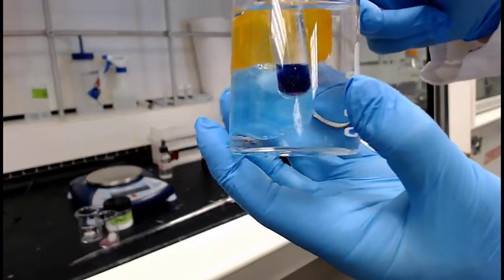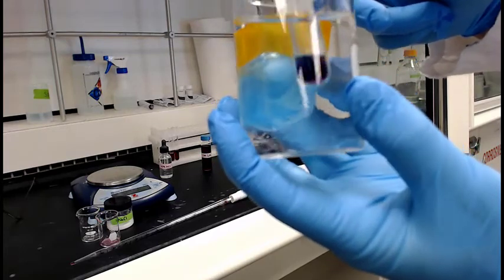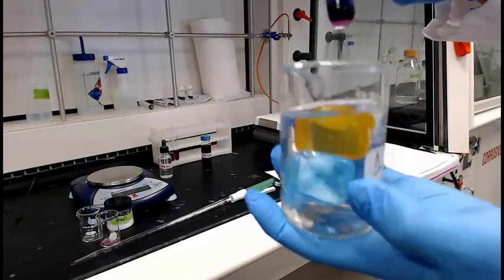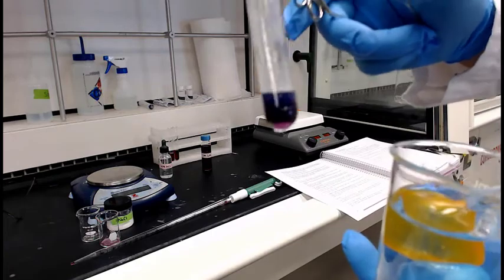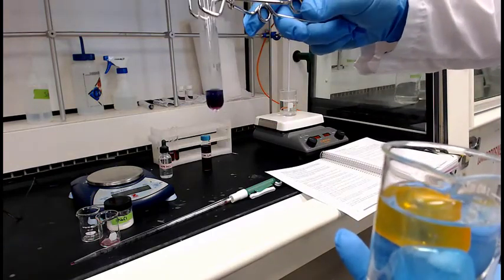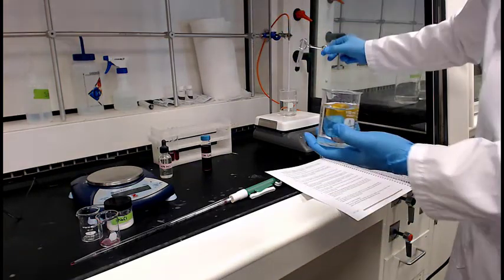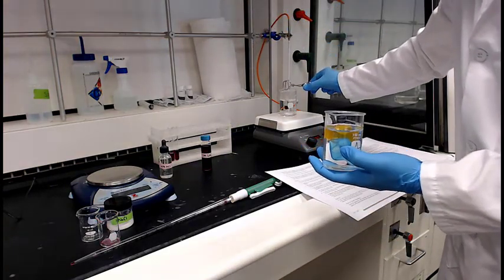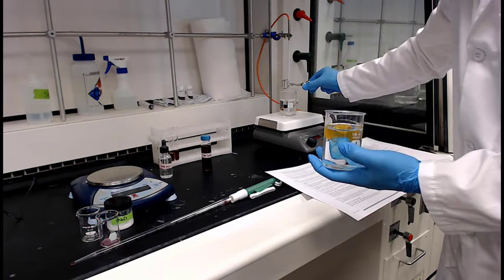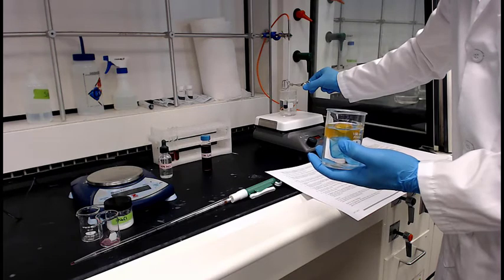So this is fun. Look at it change. He's pushing equilibrium, getting it cold. Be patient. Leave it in there. Come on. You see a little bit. I wish he'd put it back in there and let it sit for a little longer, because it'll push more equilibrium if you leave it in there. You could start to see the bottom turn purple. Now he's going back to the hot side.